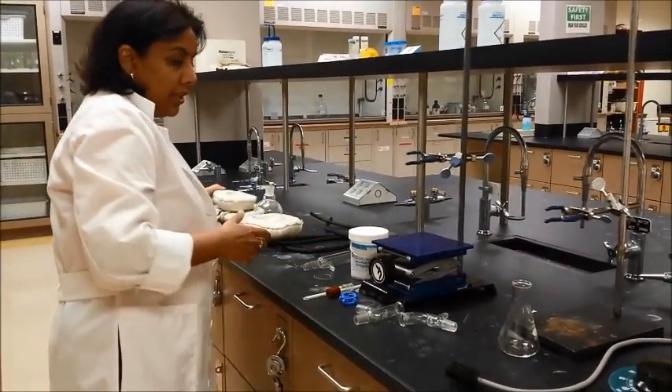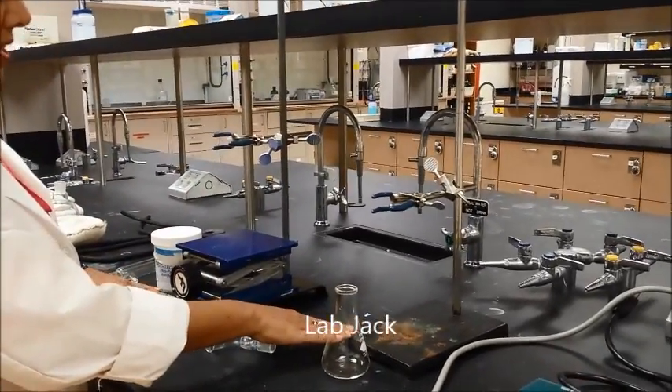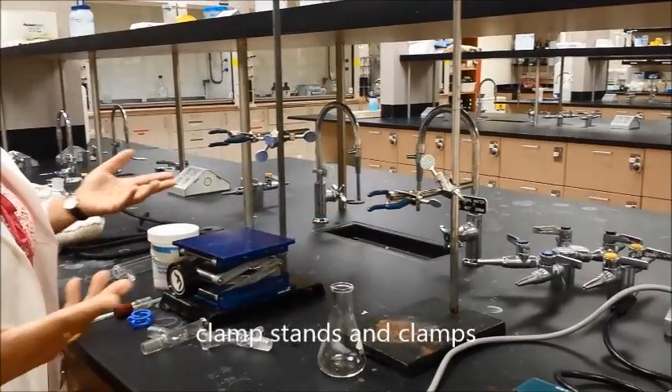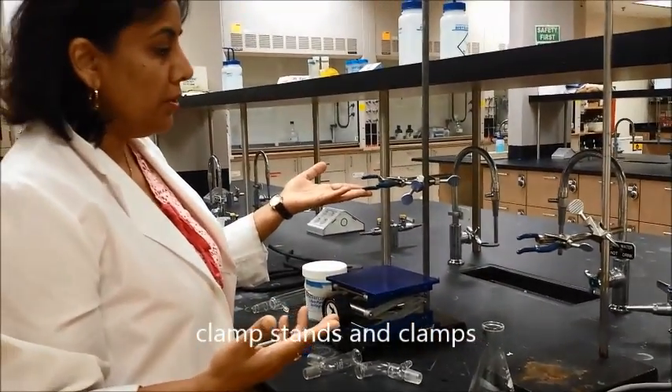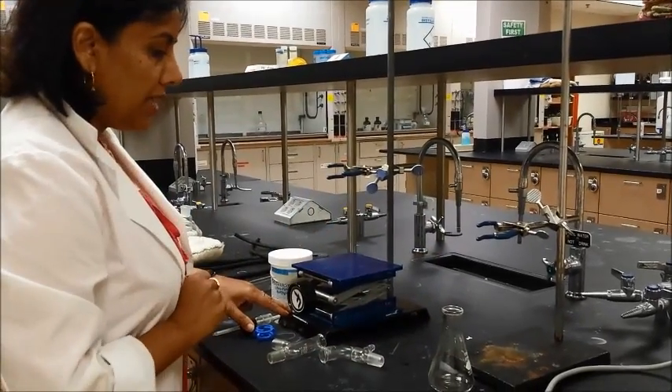Once you have that, you will also need a lab jack. You will need two stands and two clamp stands. You can use more clamps if you need to, but two clamp stands are at least what you need — at least two clamps.